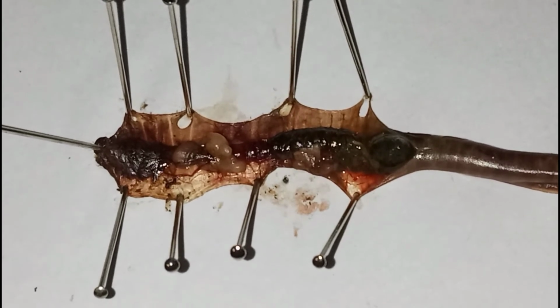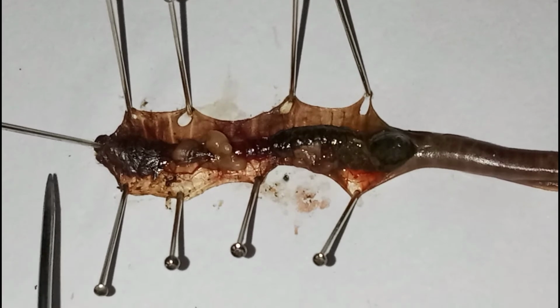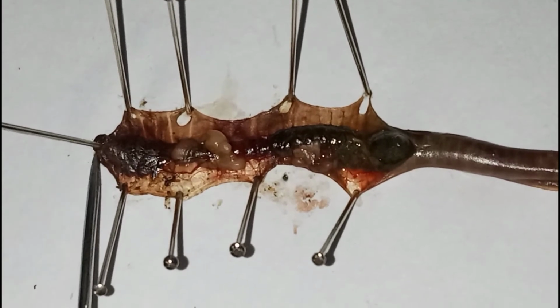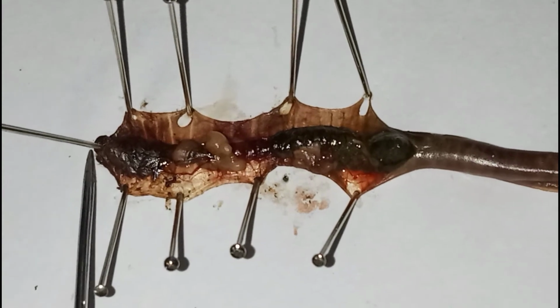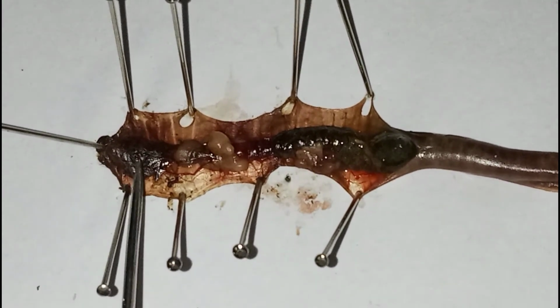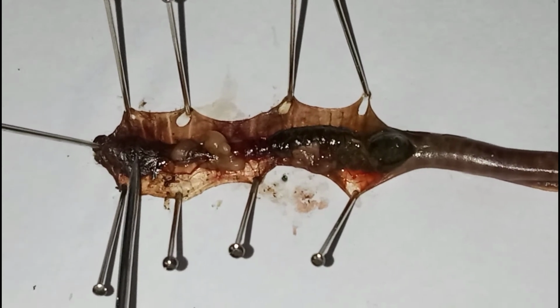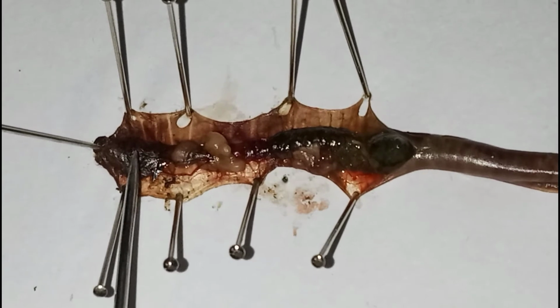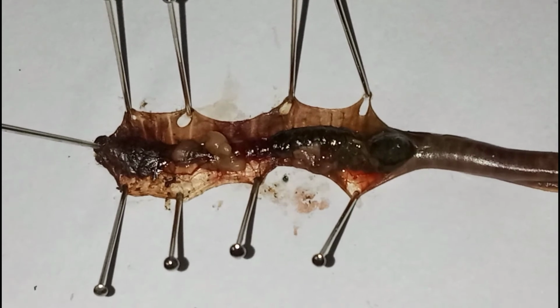Earthworms do not have teeth, but they have a lip-like extension over the mouth where the food enters. From the mouth, it passes to its pharynx. From the pharynx, the food will pass into the esophagus, but we are not able to see the esophagus because it is located and hidden under the other organs.